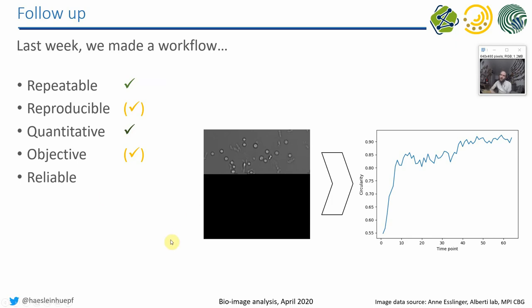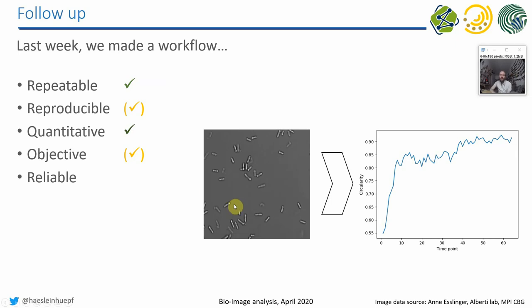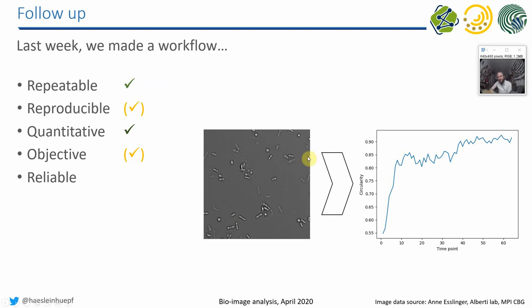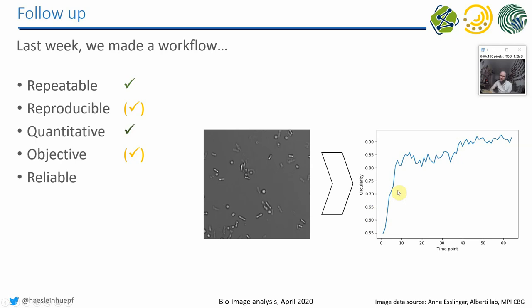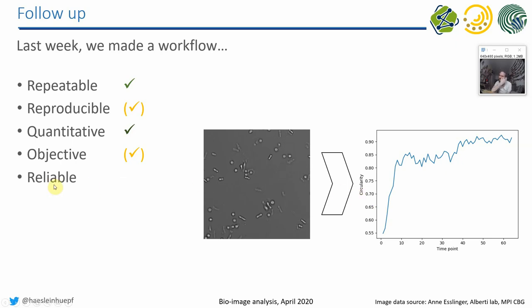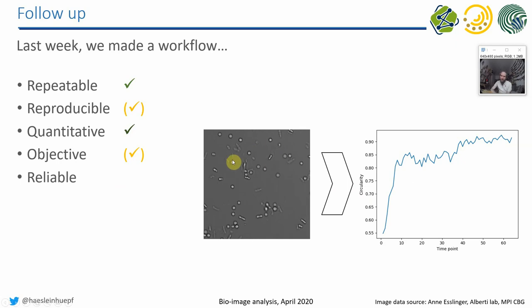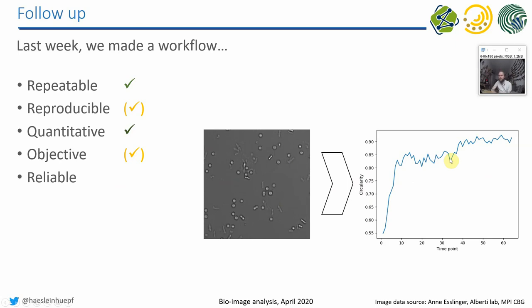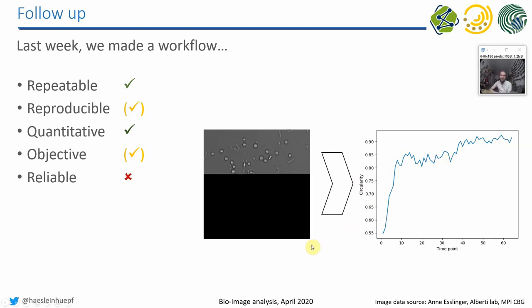And the most important question is, is it reliable? When you look here at this video and you look at the plot over time, you cannot associate the video what we observe here with the plot. So that's why we cannot say if the plot is actually related to our measurement in the image.